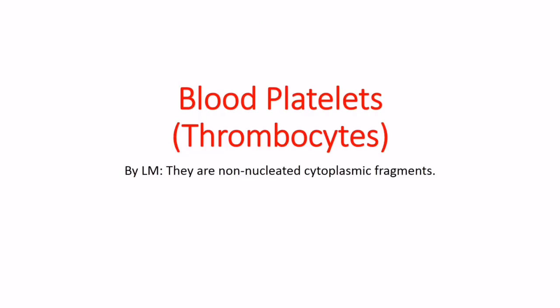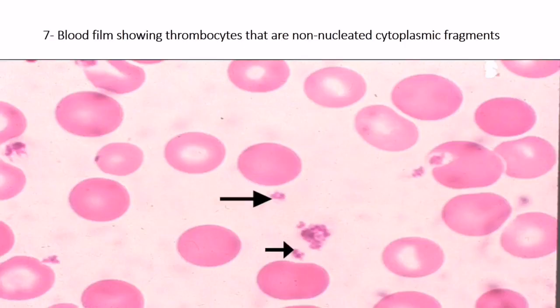Blood platelets (thrombocytes) by light microscope: they are non-nucleated cytoplasmic fragments. Here is a blood film showing thrombocytes marked by arrows, which are non-nucleated cytoplasmic fragments.